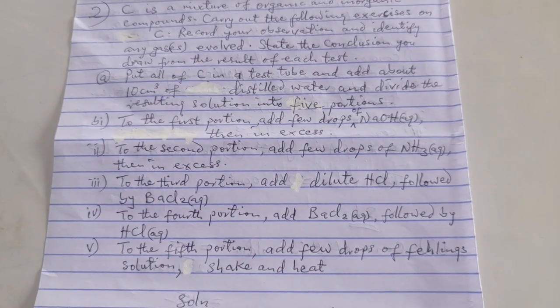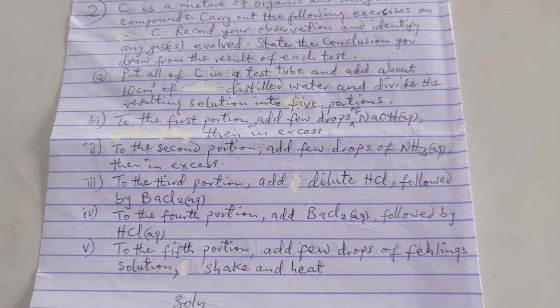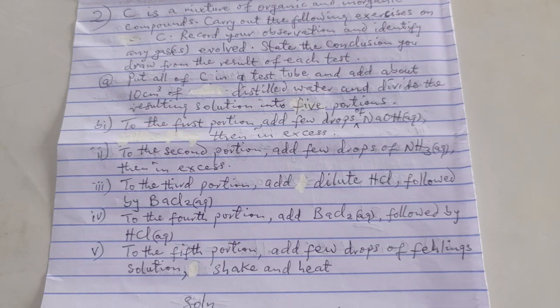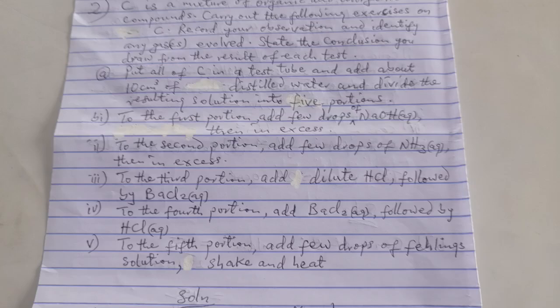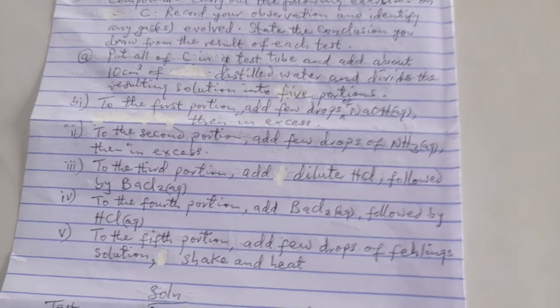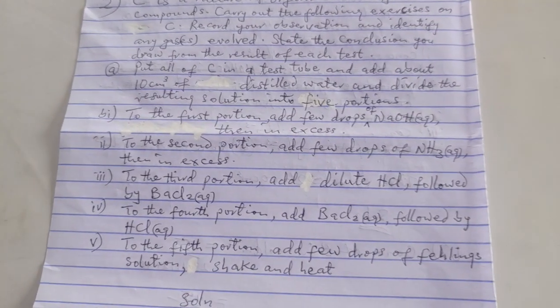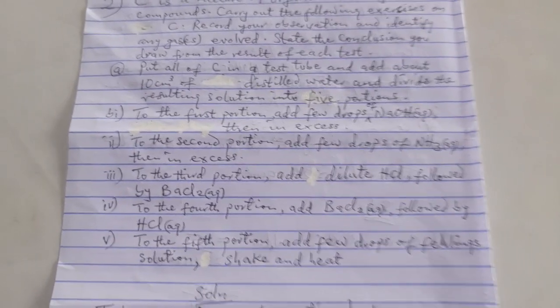So, in the first one, they said you should add sodium hydroxide in little then excess. That means you are testing for metal. Sodium hydroxide and aqueous ammonia are used mainly for cations. Now, the physical appearance of the cation you are dealing with will help you to know what substance you are testing for.